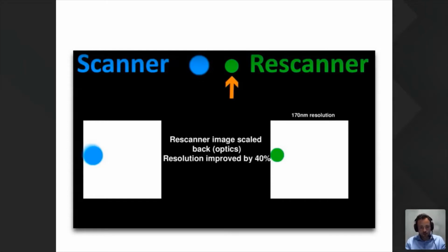And if you would like to know more about this, there's a nice movie on our webpage, confocal.nl/explanation, which tells you all about this.